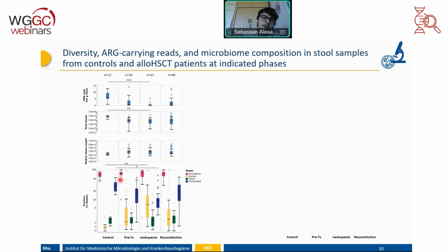But we also had a surprisingly large amount of DNA reads we could not classify with our methods, which was around 10 to 30%. This is the dark matter of the microbiome.